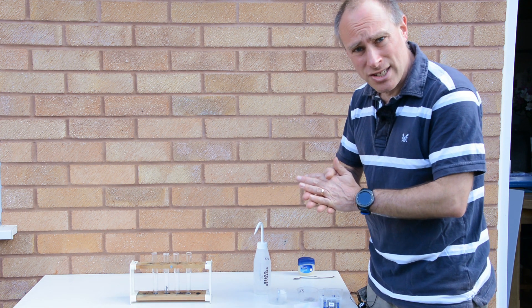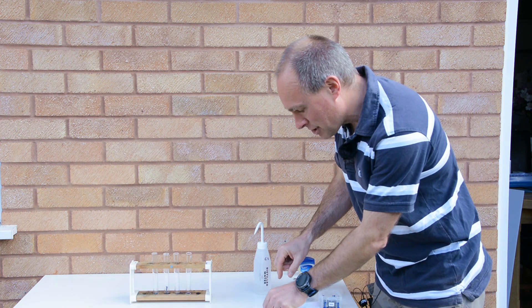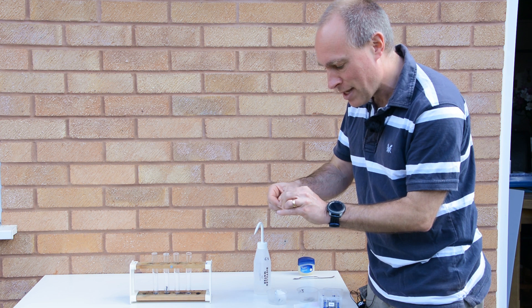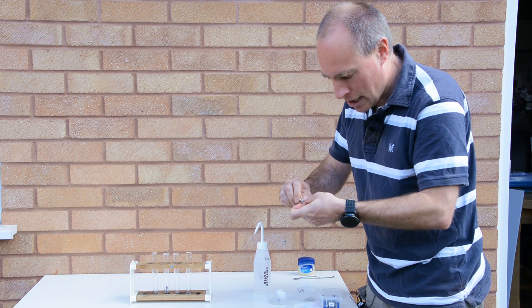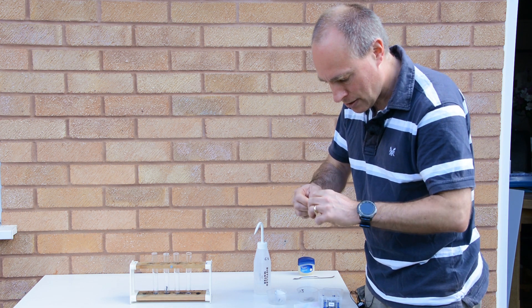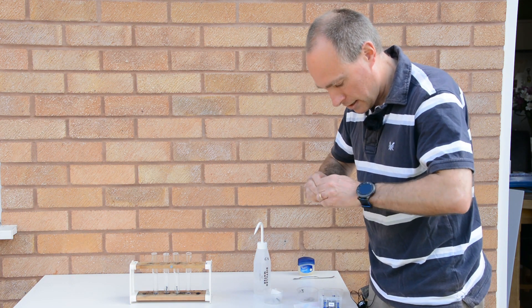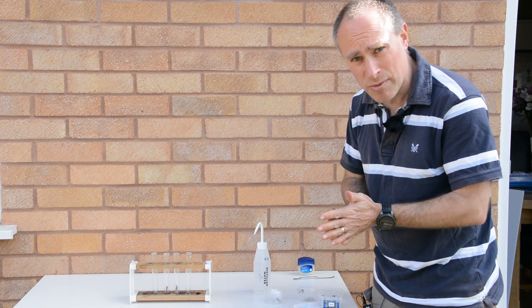In the next two test tubes I'm going to use some chemistry — I'm going to put a more reactive metal around the nail. The first more reactive metal I'm going to use is magnesium, and I'm just going to coil a bit of magnesium around the nail. Okay, so that's my two nails with magnesium around them.